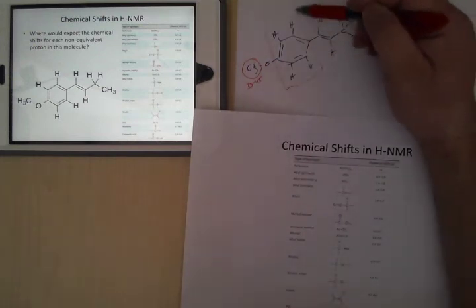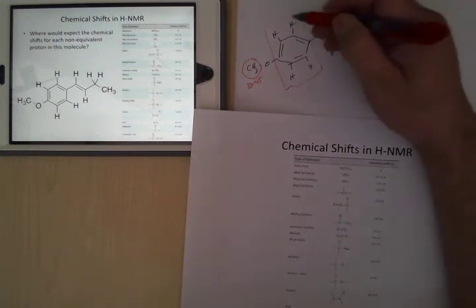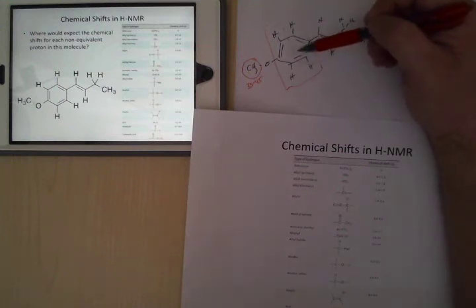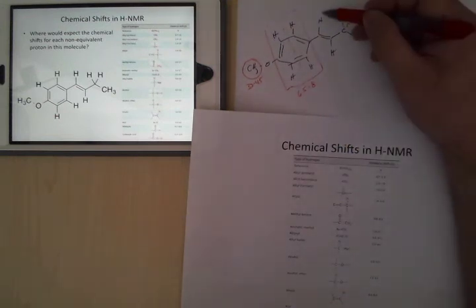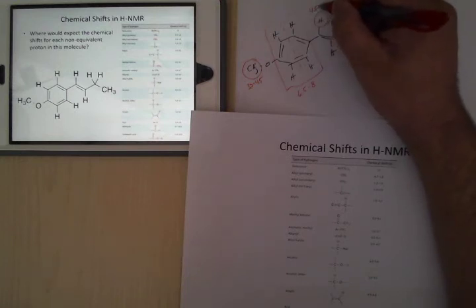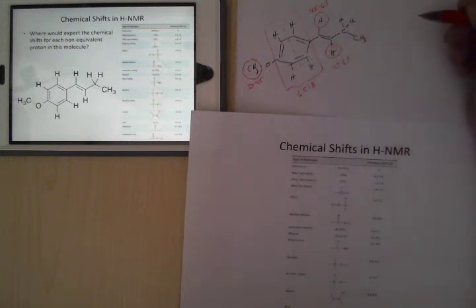These two are going to be equivalent, and these two are going to be equivalent, but they're all part of the aromatic part here. Benzenes always come up between about 6.5 to 8. This guy here is hanging directly off a double bond, so vinylic. Those always come between about 4.5 and 6.5. So that one and this one, 5 and 6.5.